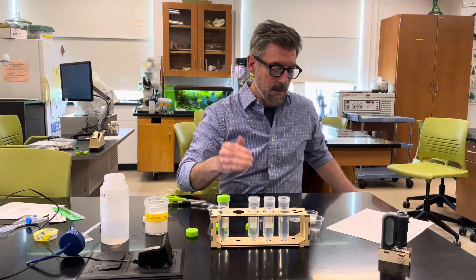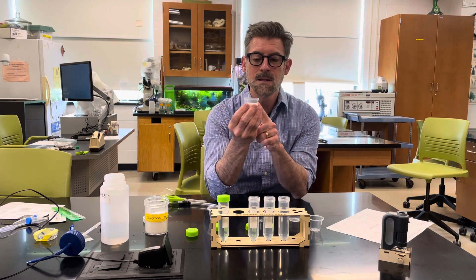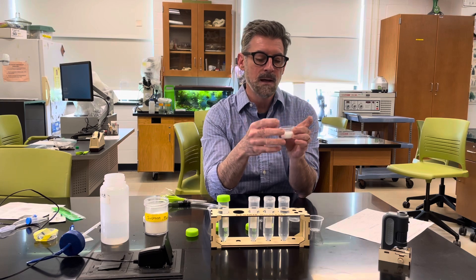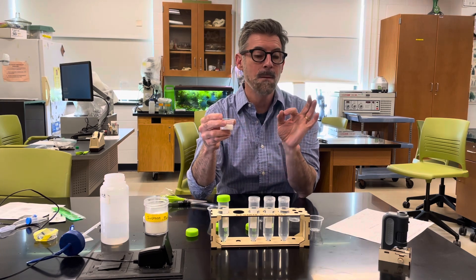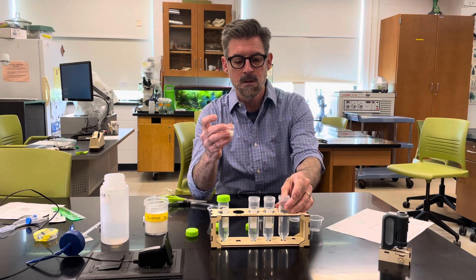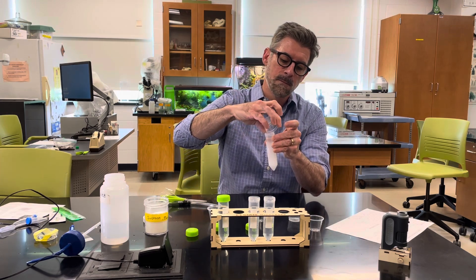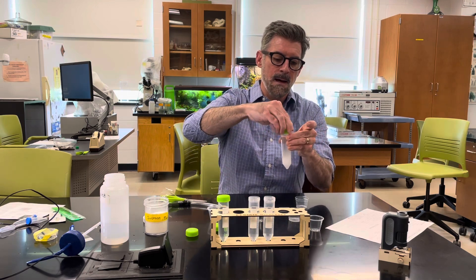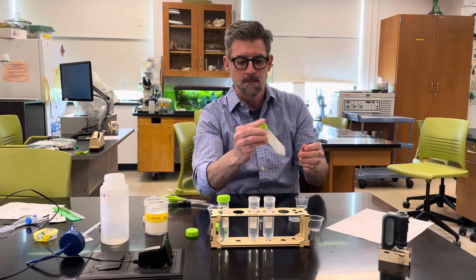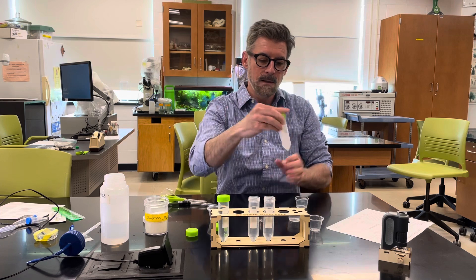I've already weighed out the sugar and compared it to the volume it takes up in these little tubes. The sugar in this weigh boat comes up to the 15 milliliter mark in the small measuring cup. If you add that to the 40 milliliters of water, it gives you a one molar solution. Add the sugar, cap the tube — it's already been labeled — then mix it and let it sit.